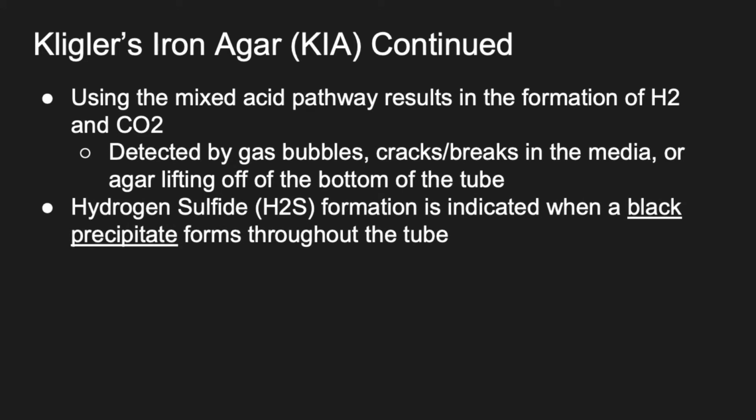Hydrogen sulfide, or H2S, formation is indicated when a black precipitate forms throughout the tube.